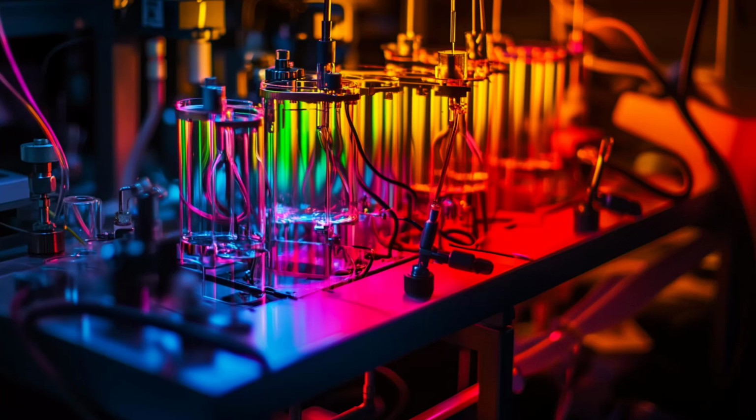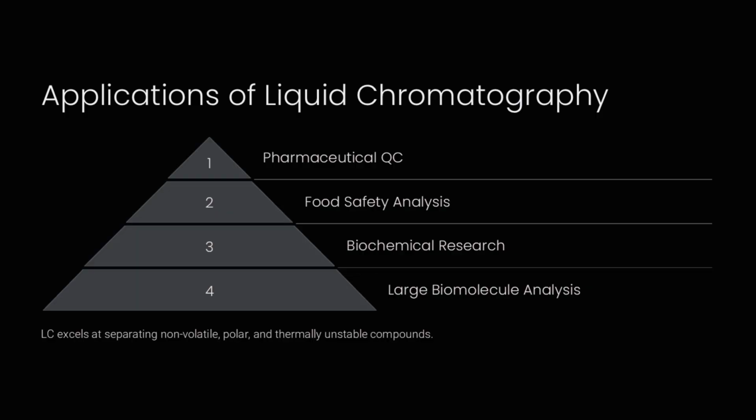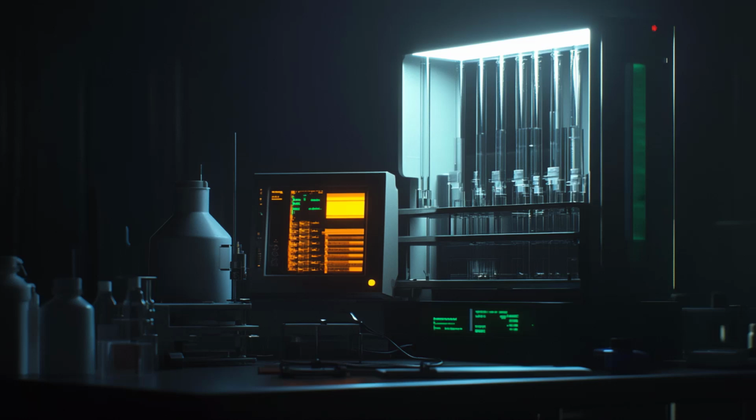of gaseous mixtures. Liquid chromatography excels at separating non-volatile, polar, and thermally unstable compounds. It is a cornerstone technique in pharmaceutical quality control, food safety analysis, and biochemical research. LC can analyze large biomolecules such as proteins, peptides, and nucleotides, which cannot be vaporized for GC analysis.